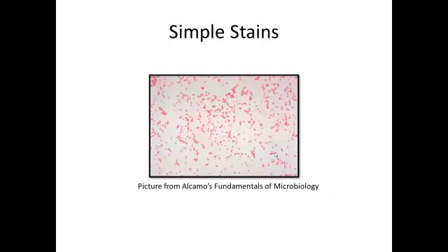So in this slide, if you look very closely, you'll see that the cells are either round or they are very short rods. Now, their arrangement, we see some that are in lines. Like right here, we see some that are in lines. There's some lines here. There's also some clusters, but we see an awful lot of individual cells. All of this becomes important in identification.